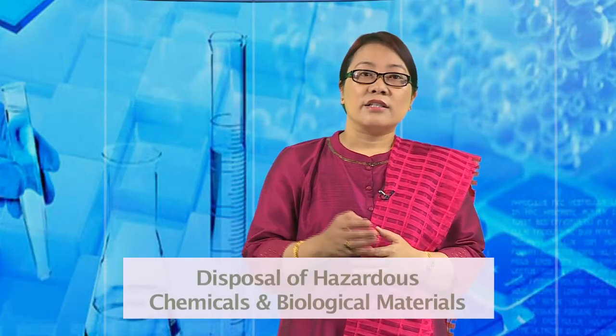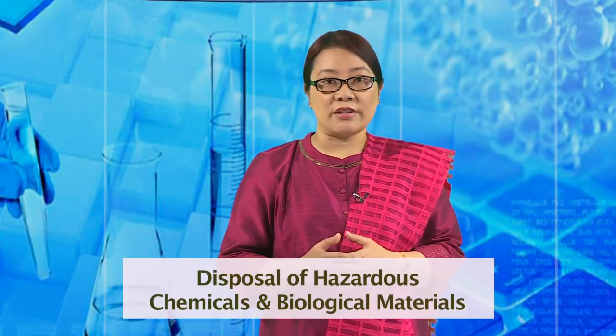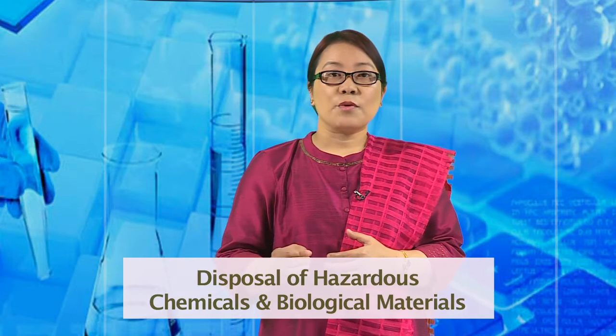Next is the disposal of hazardous chemicals and biological materials. The disposal of hazardous chemicals should be done according to the rules and regulations of the state or country. The disposal of hazardous chemical and biological waste should be discussed at the beginning of every lab.